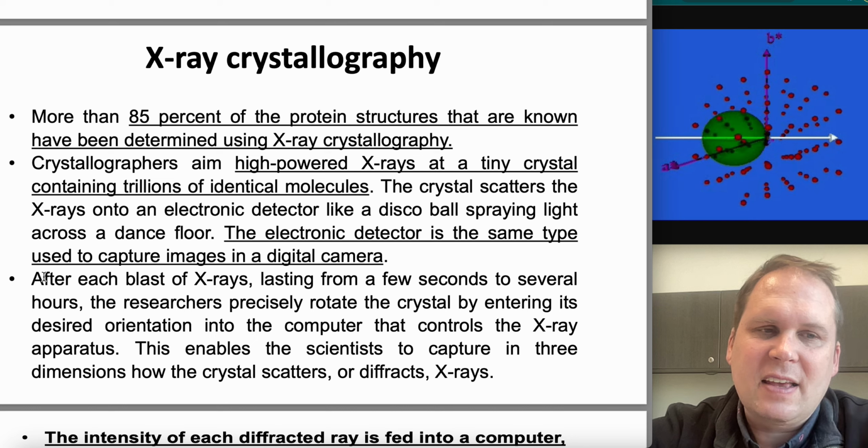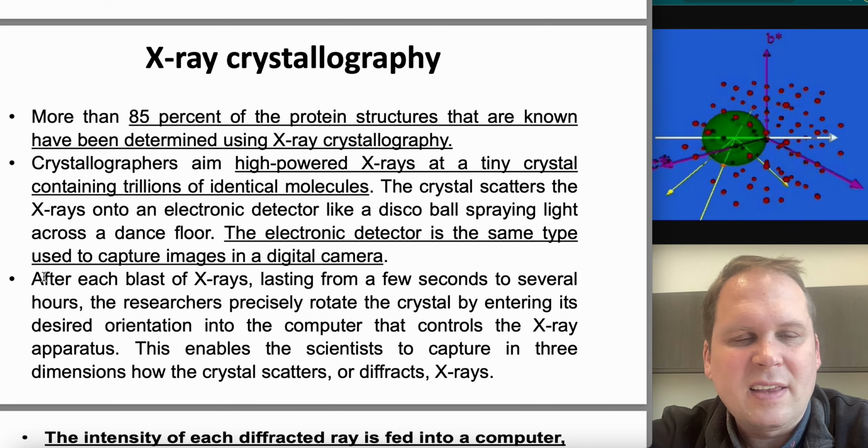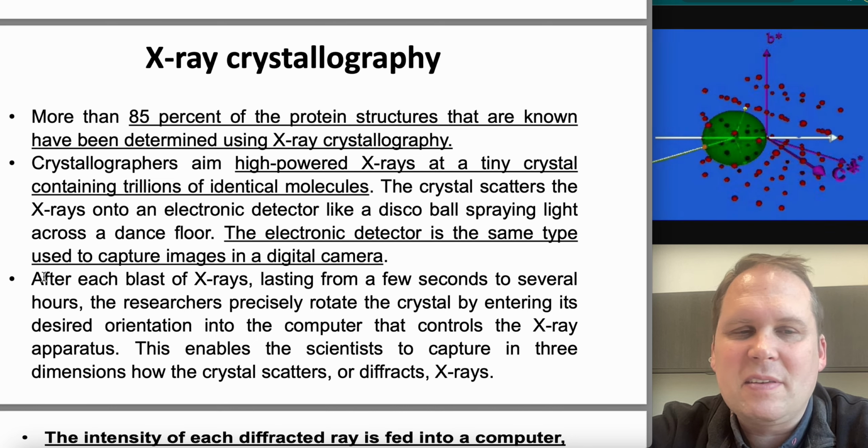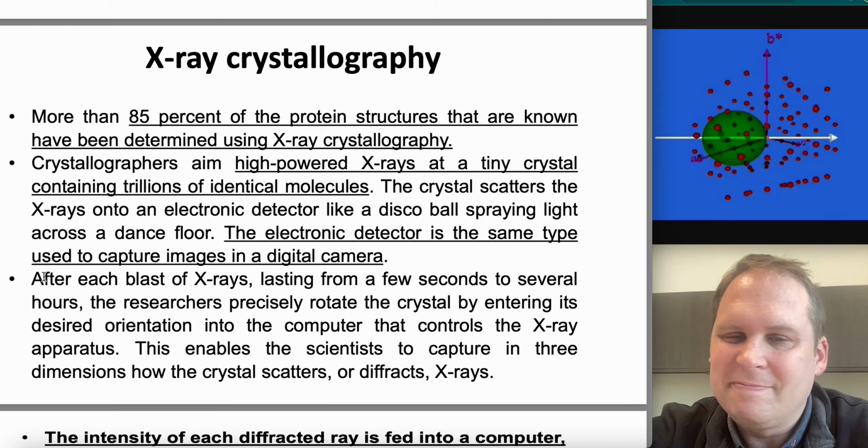The current rates, last I checked, it was about $100,000 per crystal structure in time, in materials, in people, in X-ray source rental, all this stuff.